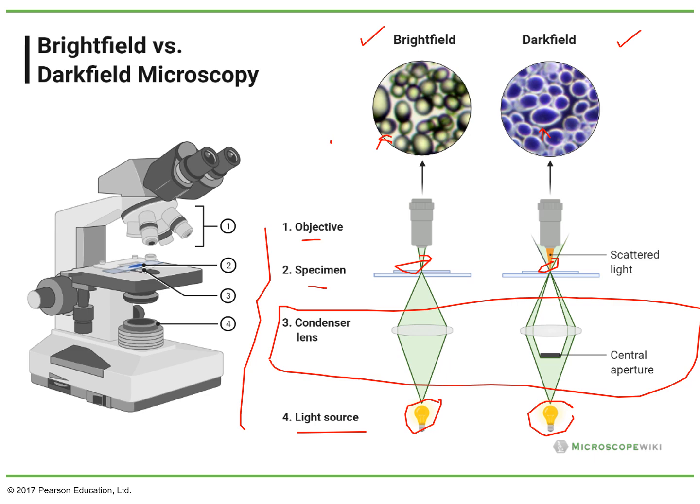The dark field will not tell you a lot of information about what is happening inside of the cell, but it is very good to outline the cell. Each type of microscopy is useful to answer different types of questions, and in the lab we will talk more about that during the semester.